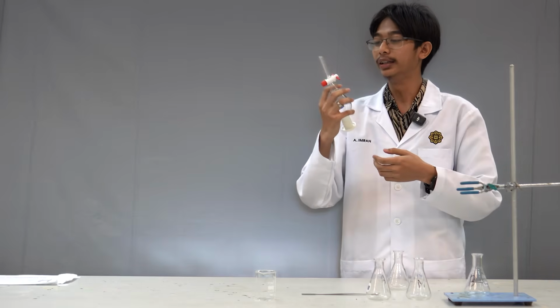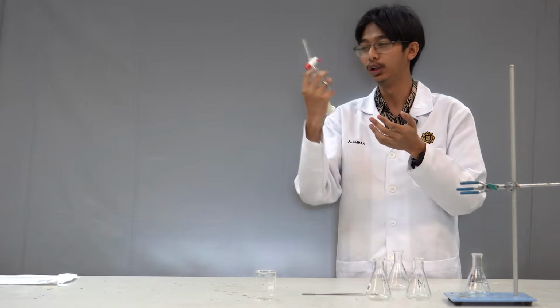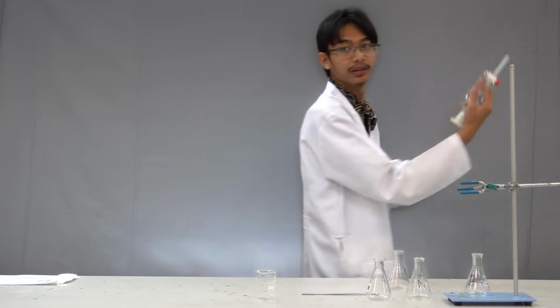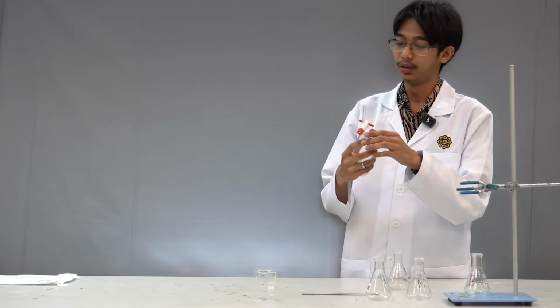And make sure that even while it's horizontal, you're not shaking in the general direction of someone else. Meaning to say, if there's someone next to me, I would prefer to shake it somewhere in this direction. So, going back to the topic on hand, which is on mixing.